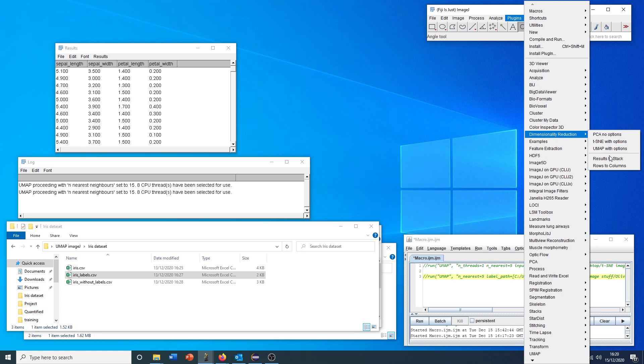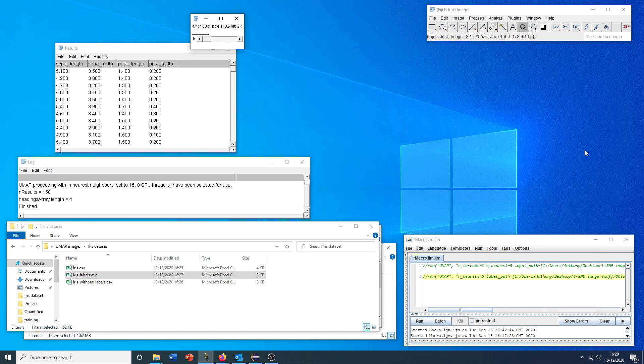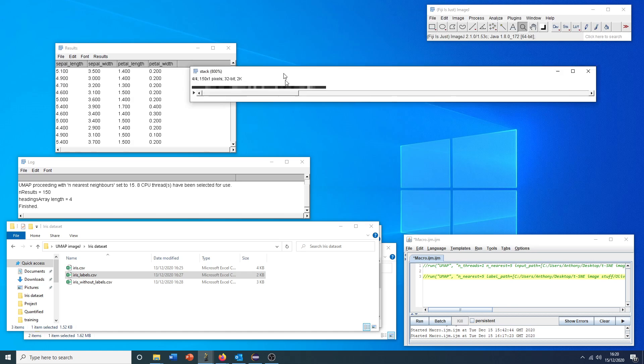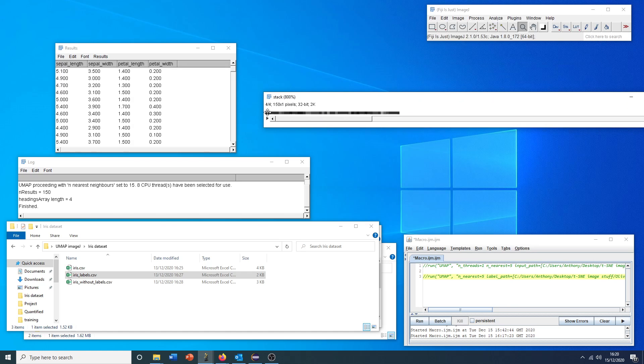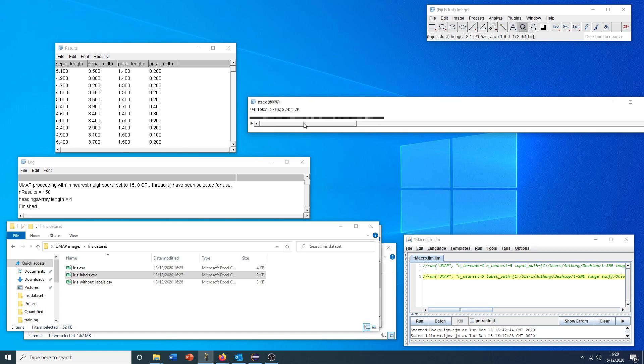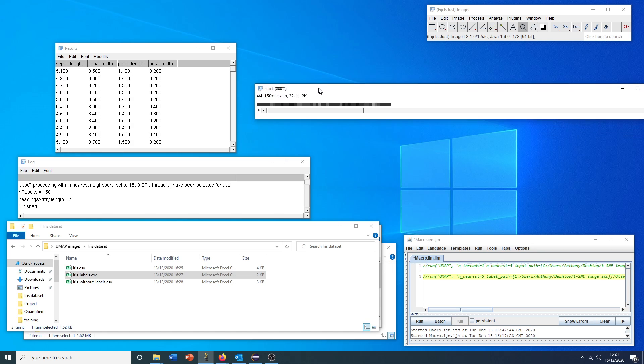If we go to results to stack, this data has now been encoded in this image stack. Each of these pixels, these little squares, is actually this number represented in a 32-bit format. So it should be fairly resilient to very big numbers, decimal numbers, etc.